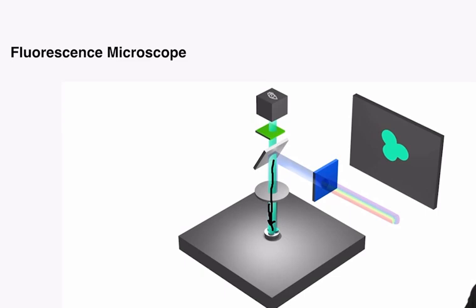So the basic functioning of a fluorescent microscope requires two things. One is going to be an ultraviolet light via a mercury lamp, and the second is going to be the working of a dichroic mirror, which is very essential for the working of this microscope. Finally, ending it with questions important for INI CET exam.